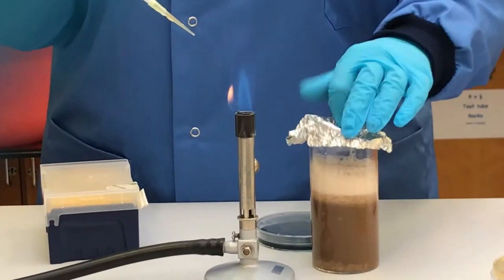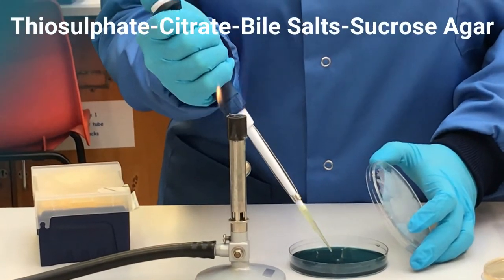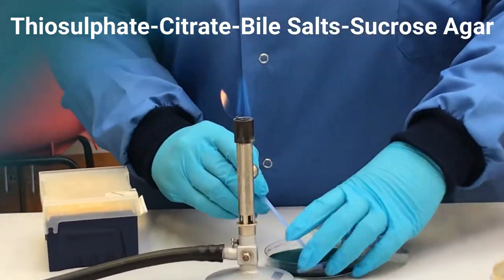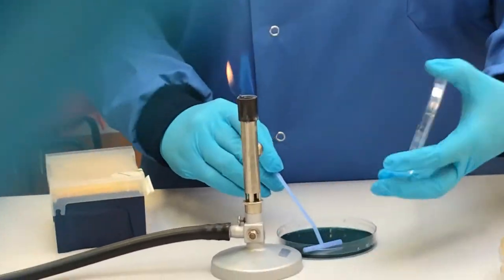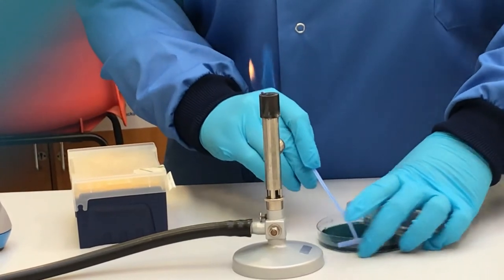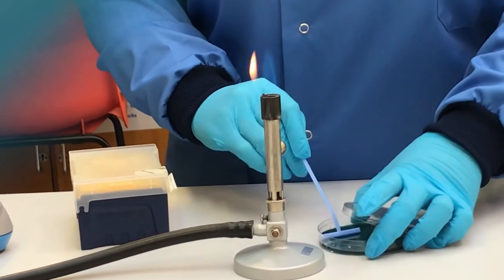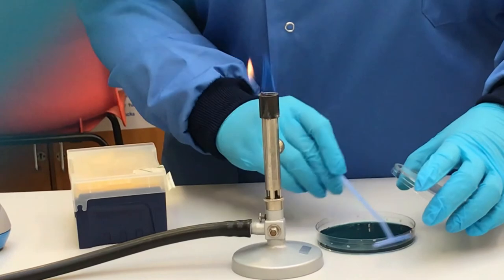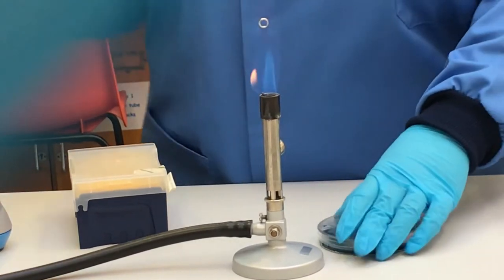But this time you should plate with thiosulfate citrate bile salts sucrose agar, also known as TCBS agar. This agar is used to isolate Vibrio species and is highly selective for Vibrio cholerae and Vibrio parahaemolyticus.